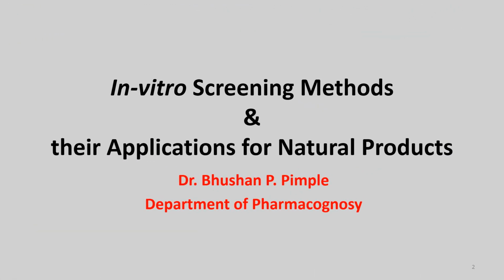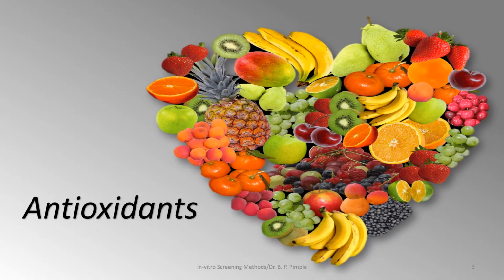Myself, Dr. Bhushan Pimple. In this video, we will discuss the in vitro screening methods and their applications for natural products. That means how to screen the natural products for their various applications or indications. First, we will discuss the antioxidants.